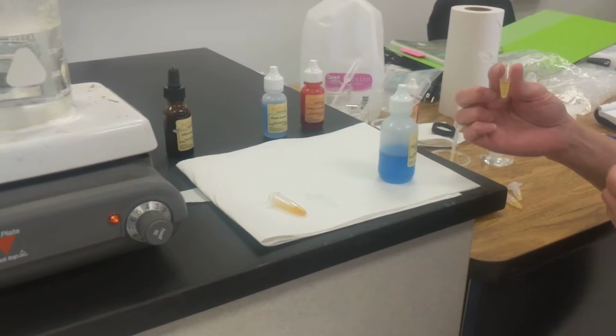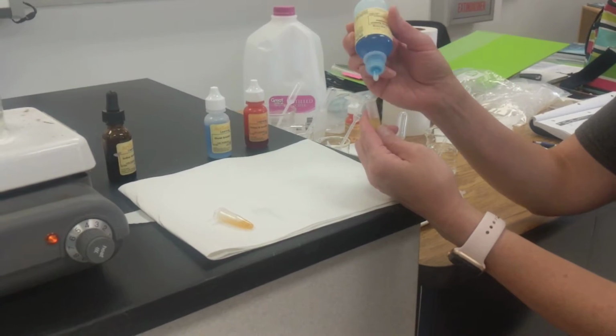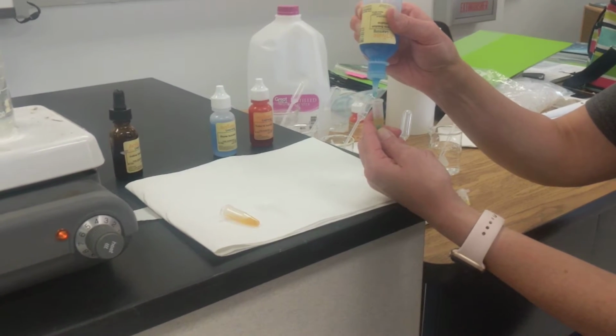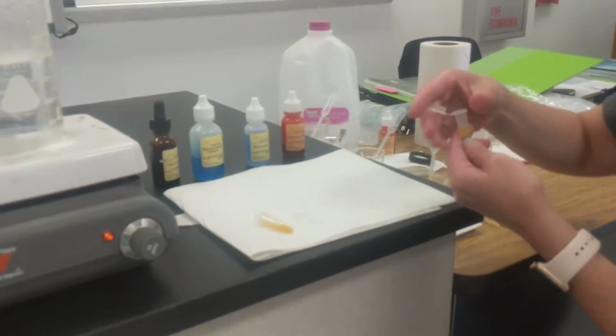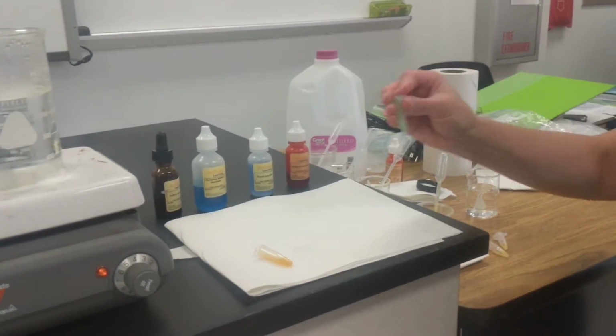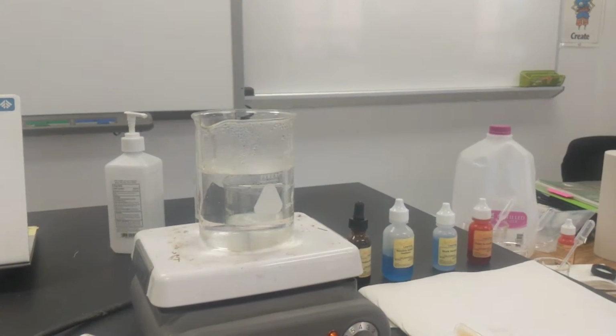Okay, our next one will be Benedict's solution, okay? And that's blue. Remember, we got to put that in a hot water bath to find out if it has sugar in it. So get a couple drops in there. Close this up. Shake it up. Oh, it's already kind of green. So let's see what happens with that.